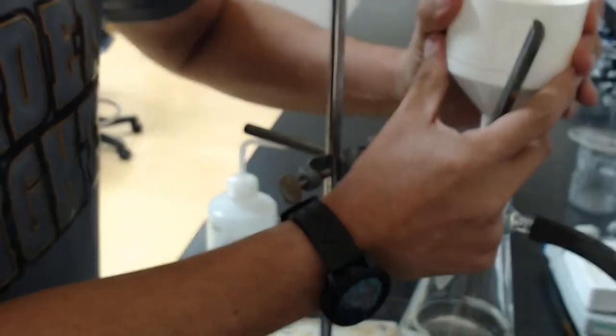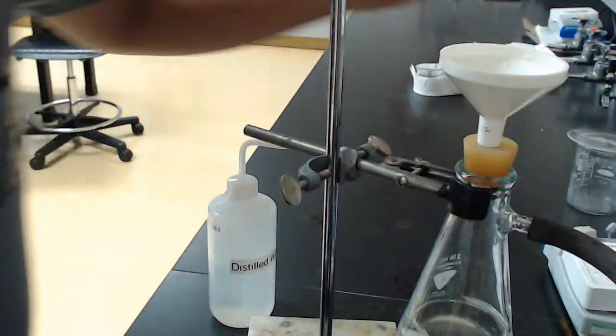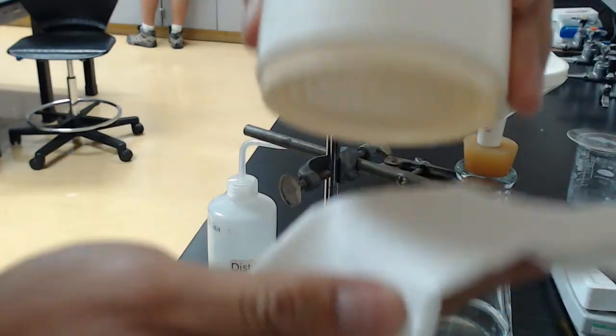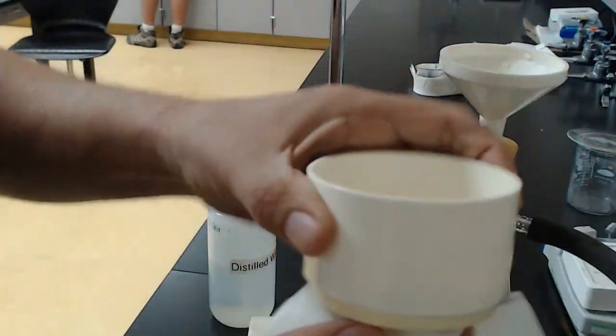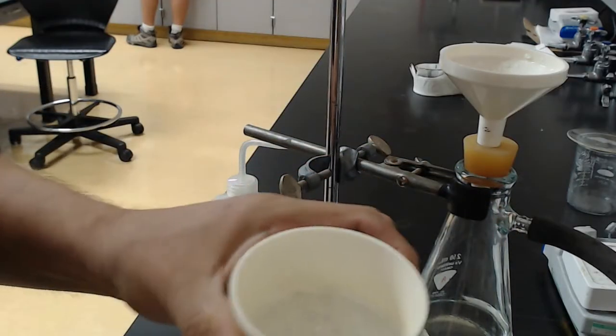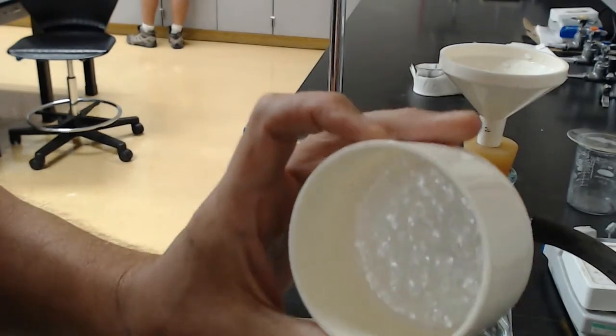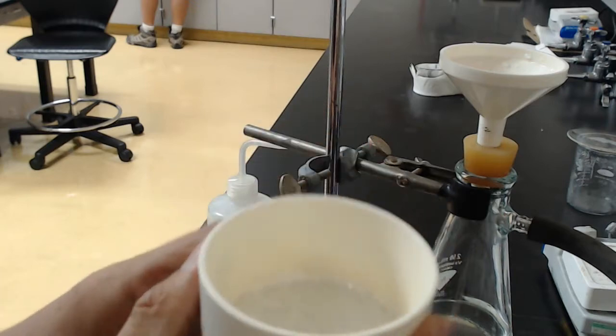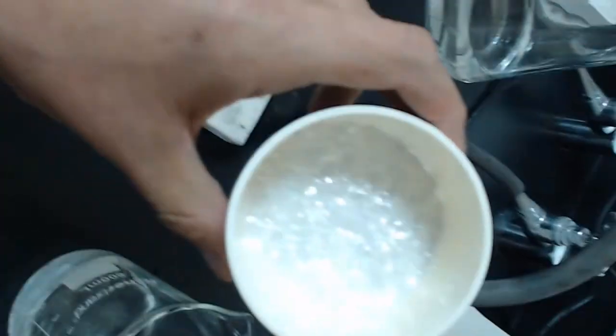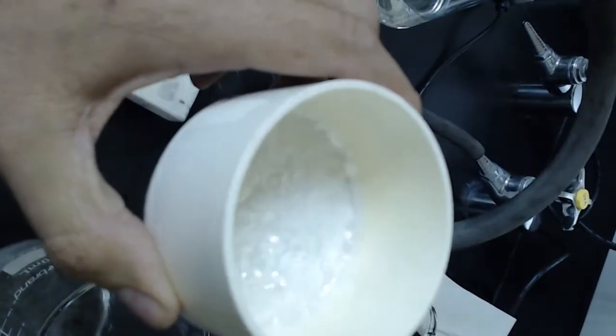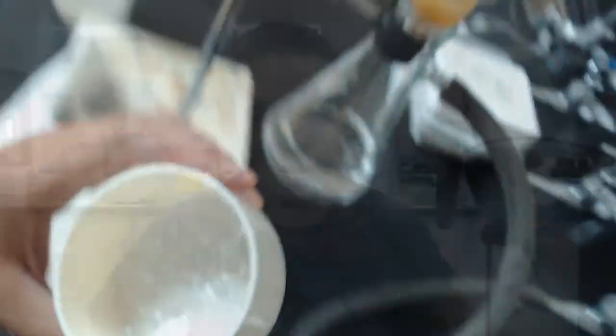So, the whole top part pulls off. So, remember, before you get a weight, you're probably going to have some water collecting on the bottom here. And that adds to your weight. So, just make sure you dry that off. I typically will dry this off and then run it on the vacuum longer just to make sure there's no water. But look at this stuff. It looks like glitter almost. I'm going to get a good view of this. Yeah, there we go.